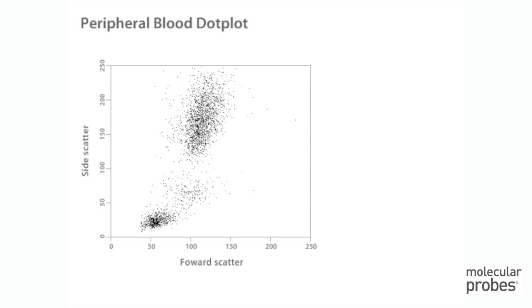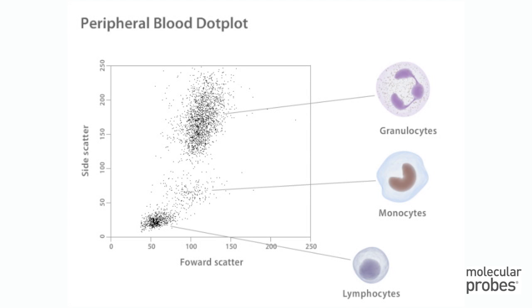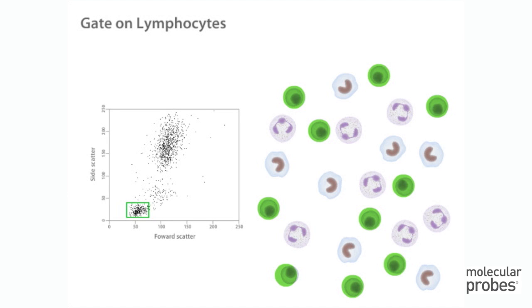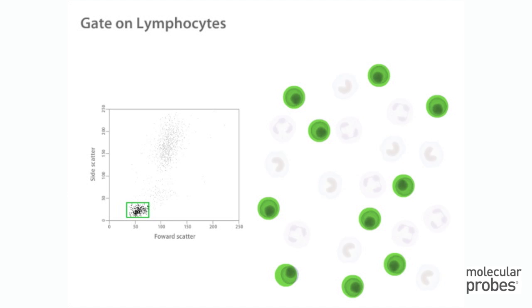Let's look at the first step of the analysis in more detail. To exclude populations that are not relevant, we use a forward scatter versus side scatter dot plot to distinguish populations of lymphocytes, monocytes, and granulocytes. This type of plot uses linear scaling and is not based on any fluorescence signal. Most cell types have scatter properties that help us visualize various subpopulations in this way. Note that the blank area to the left is our forward scatter threshold set to exclude debris from the analysis. The lymphocyte gate is created by drawing a region around the lymphocyte population.